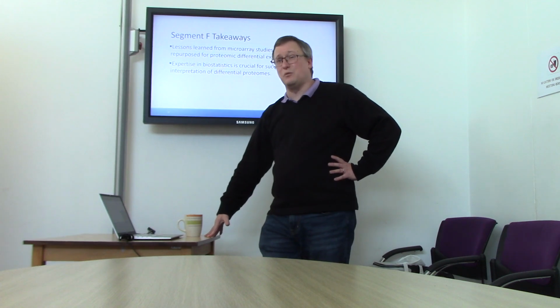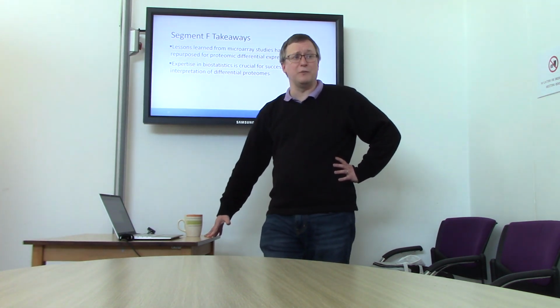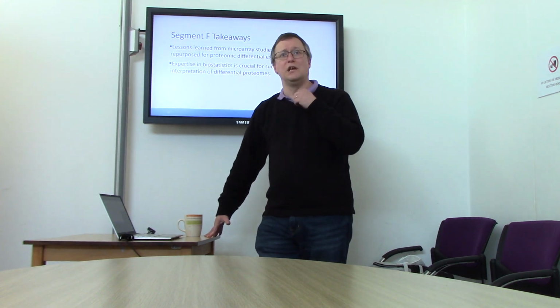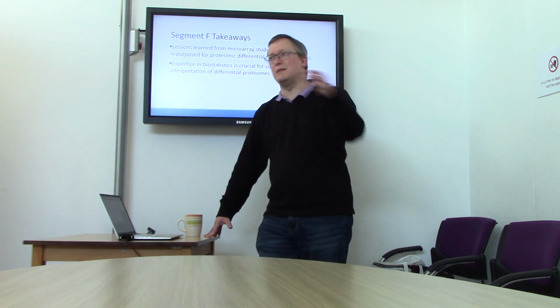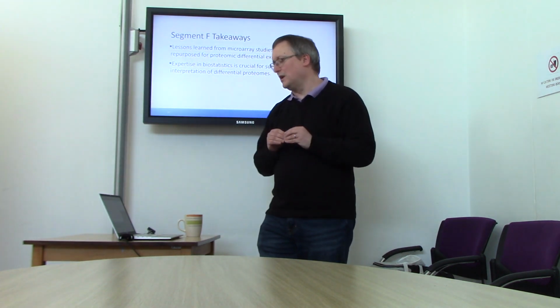Okay, so we move to our final section's takeaways. There are plenty of things that we learned from microarrays, things like volcano plots and MA plots and things like that have simply been repurposed for use in proteomics. Sometimes the way that we build our data in proteomics, such as using spectral counts, can be very problematic when we try to simply apply the same lessons from microarray statistics in proteomics. So be aware of that distinction.